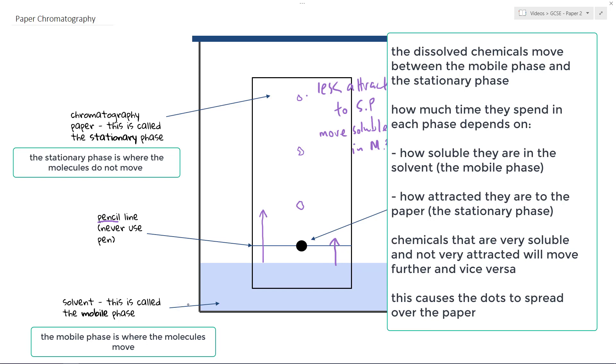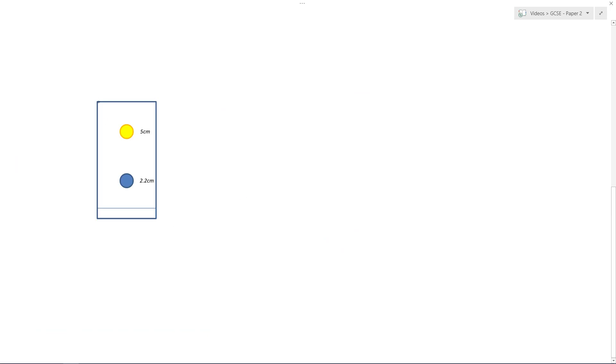There is one more bit to look at: RF values and how we can use those to further and better analyse a chromatography experiment. This finished result is called a chromatogram — the outcome or product of a chromatography experiment. In this case, my dot has resolved and I'm left with two dots at different positions on the paper.